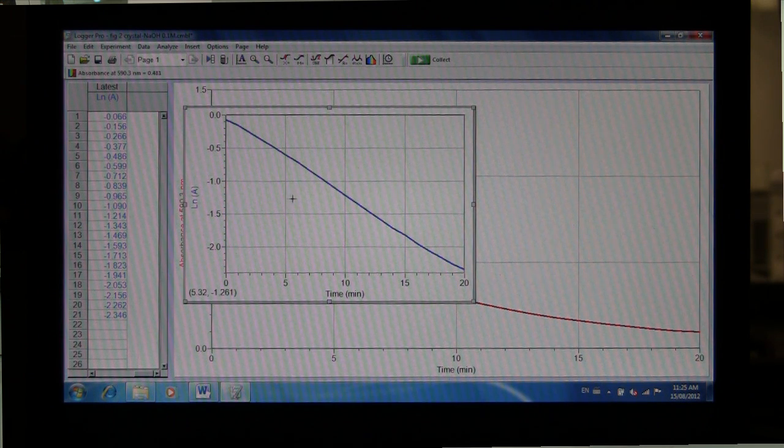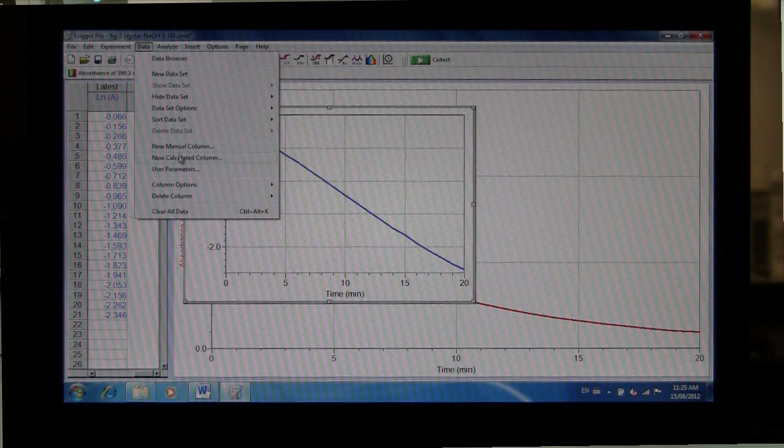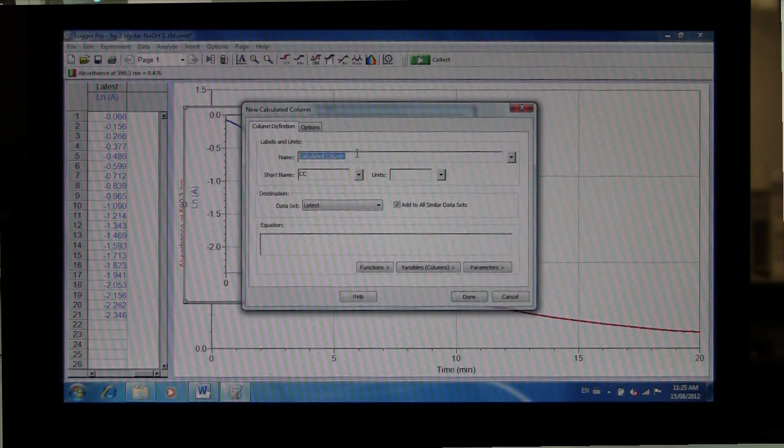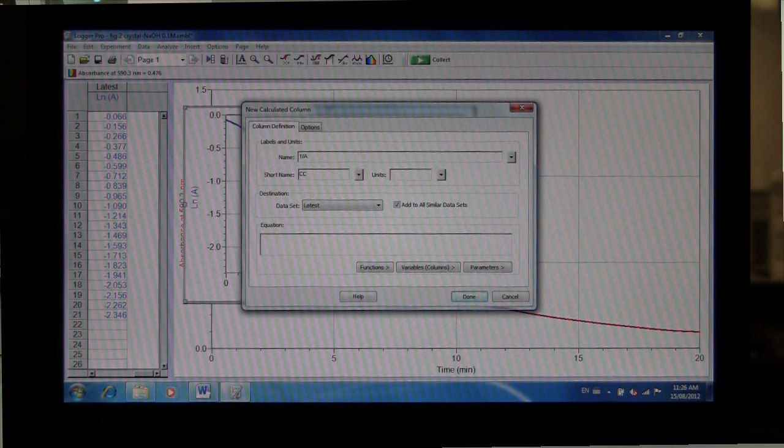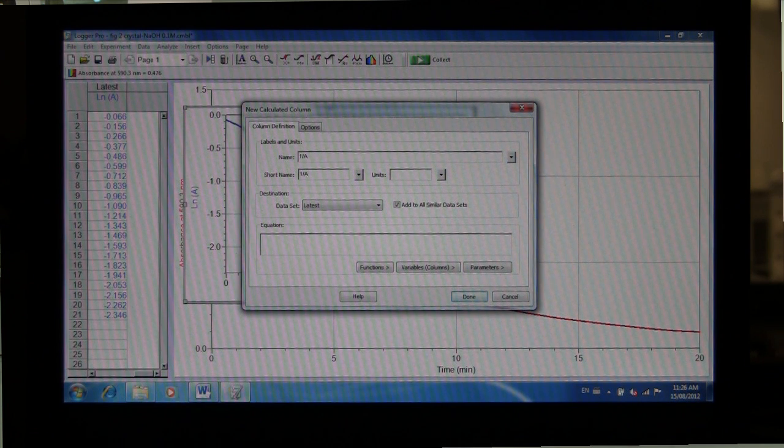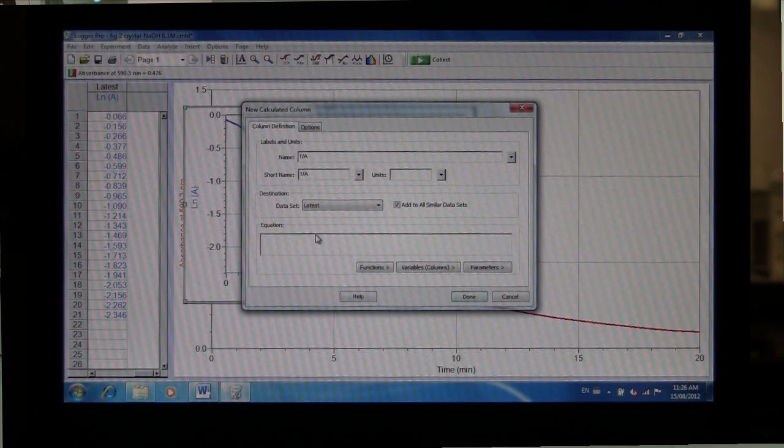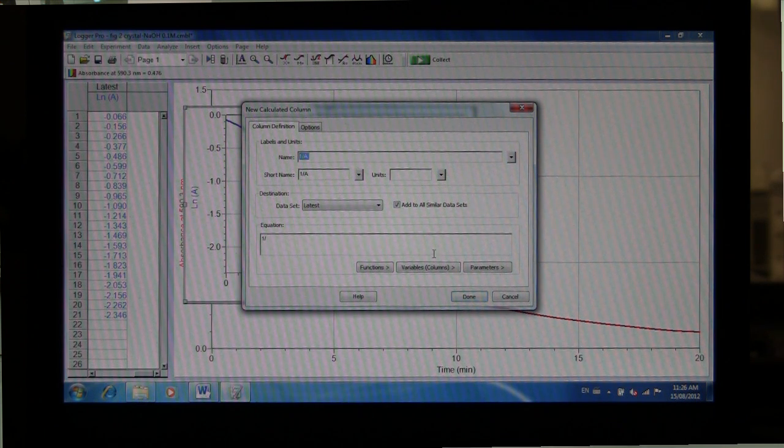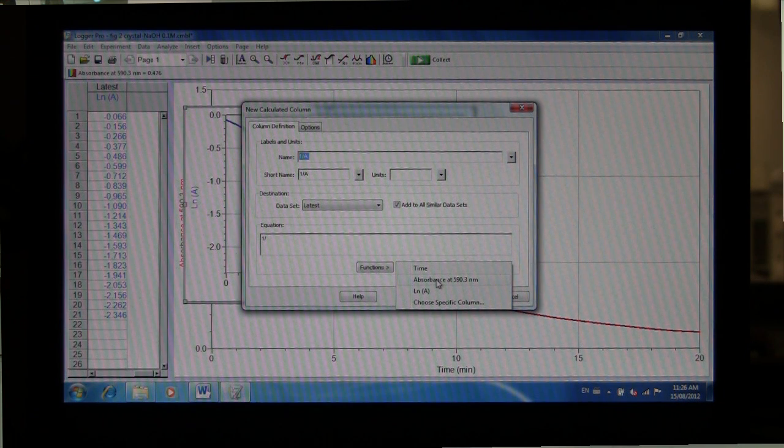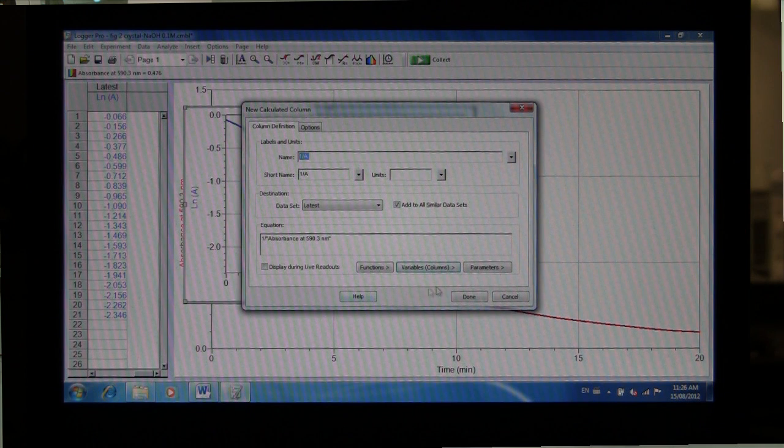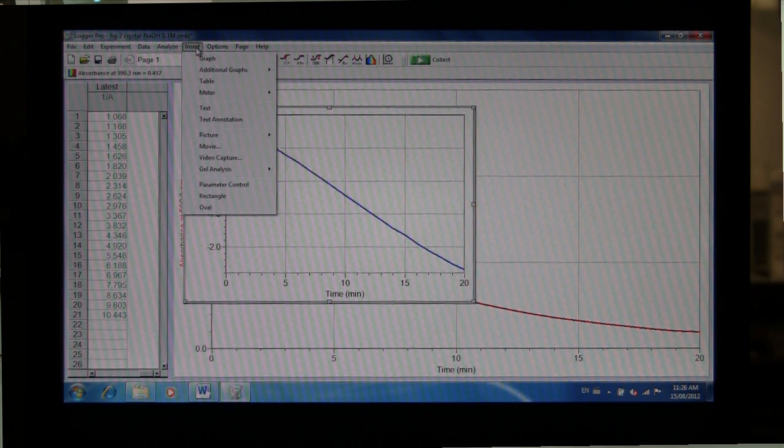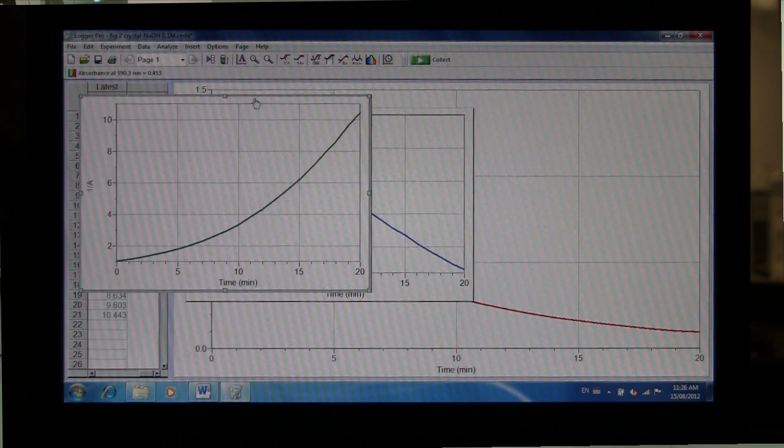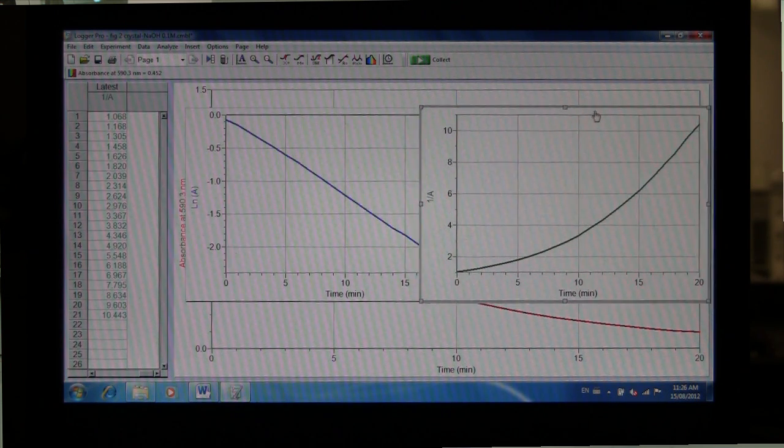To create the second plot, you do the exact same thing. So we go into Data, New Calculated Column. And our second plot is the inverse of the absorbance, or 1 over A. So we'll type that in our window here. And in the equation, just type in 1 divided by, and then under Variables, choose the same variable, absorbance. Click Done, and then go to Insert, Graph. And it will display the other graph with that function.